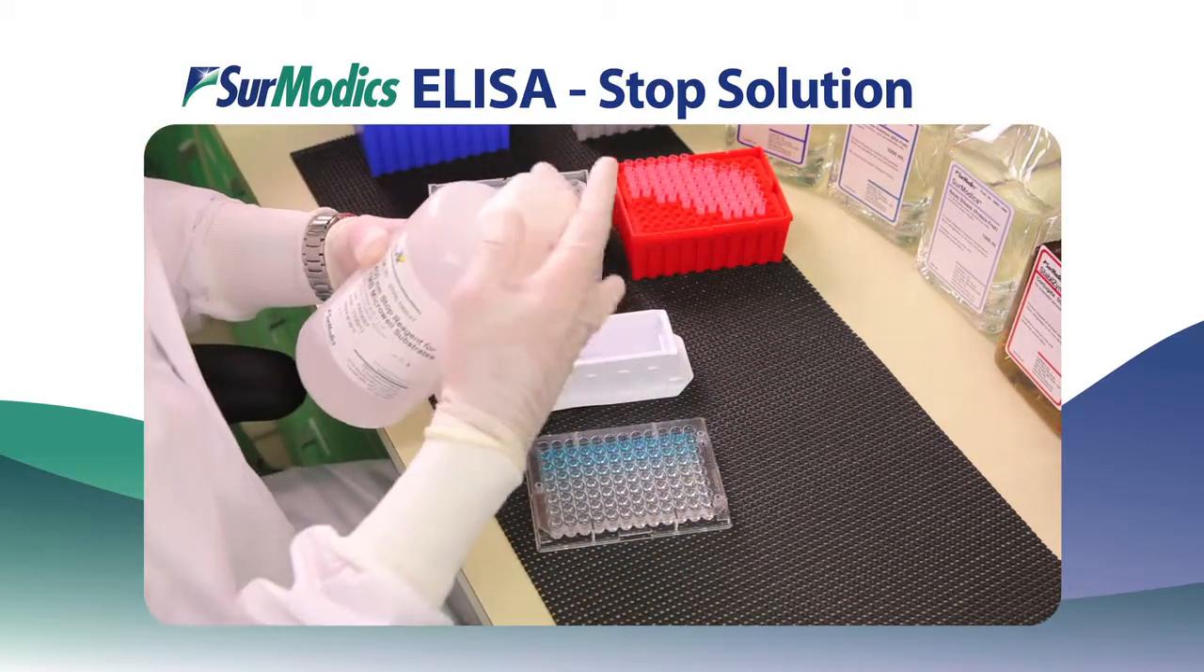After 10 minutes, add 100 microliters of BioFX Stop Solution to each well of the ELISA plate.